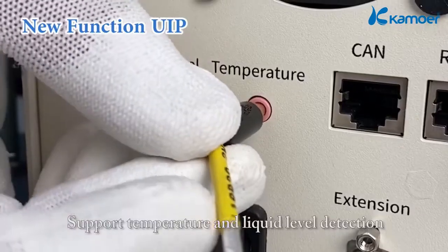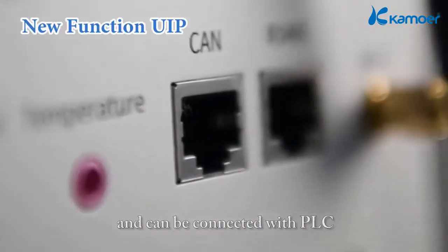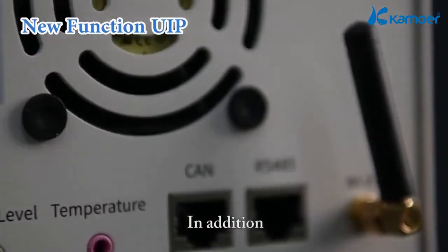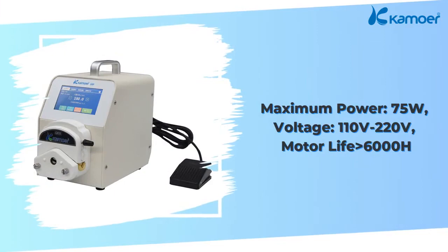It supports temperature and liquid level detection and can be connected with PLC. In addition, the built-in Wi-Fi antenna allows it to be controlled by mobile phone.